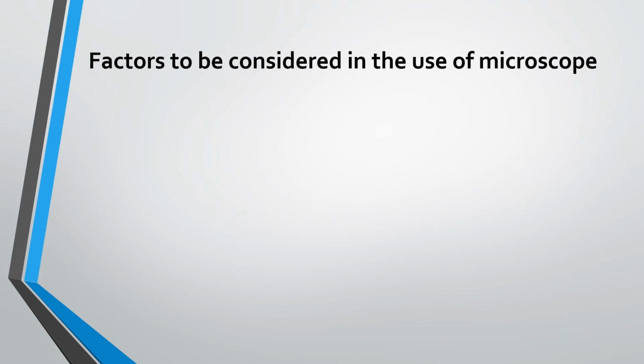So now you know how to use a microscope, and here you are going to learn what are the main factors that you should consider in using a microscope.